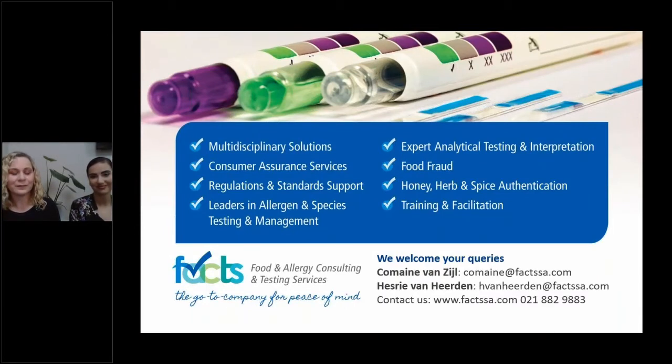Okay, ladies, I'd love to talk more. There are a couple more questions. I'd like to take one more if you don't mind, because I think this is a question that a lot of people maybe don't understand. If all our products contain the same or similar allergens, and I know there's a distinction between similar allergens and the same allergen, but the question comes down to a facility where all our products contain some kind of allergen, and then we've got very distinct processing lines where we don't want any contamination. So Nyana's question is, do I still need to do tests on cleaning efficacy if all my products contain allergens, in a mixed bunch?